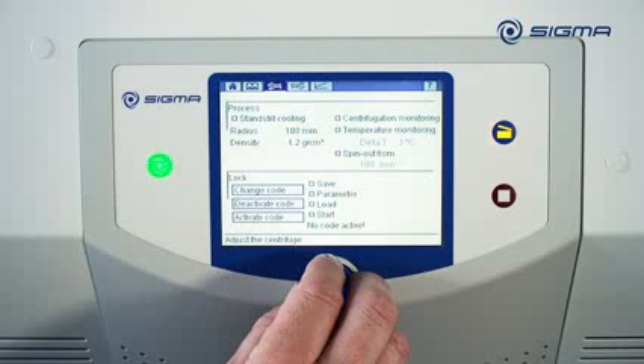Under Lock, you can protect saved programs with a password number. This prevents unintentional or unauthorized changes.